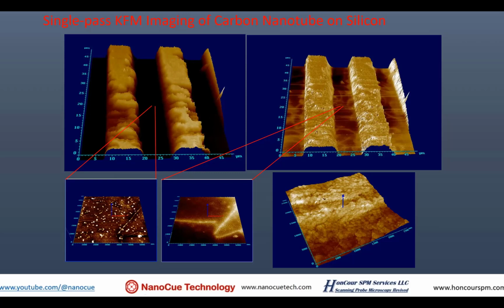When you do things on an insulator, for example on a piece of Teflon, the problem is that because it has very low capacitance, any little bit of charge on it generates thousands of volts of potential. So in other words, it quickly overwhelms you. The entire KFM doesn't even work because either you have very strong charge or no charge, whatever it is. It had nothing to lock on. The charge is too strong. Yes, an ideal substrate is silicon, actually.